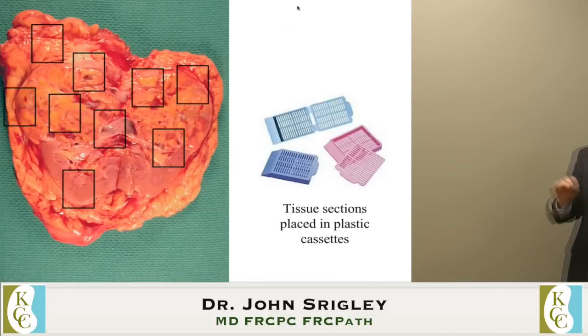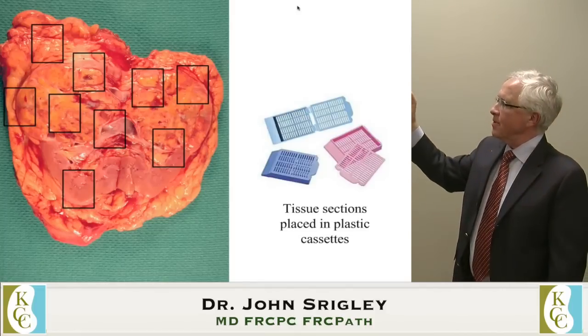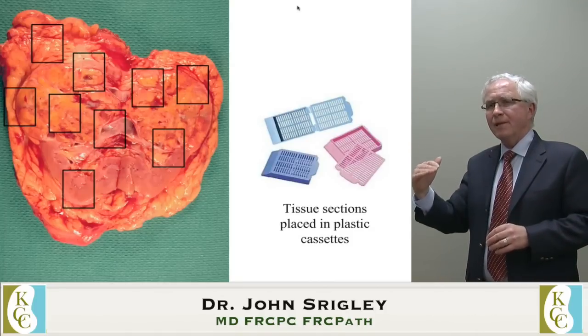Then the next thing we do is take samples of that tumor. We take samples around the edge to see if the tumor is invading into the fat. We take samples around the blood vessels to see if the tumor is invading the blood vessels.